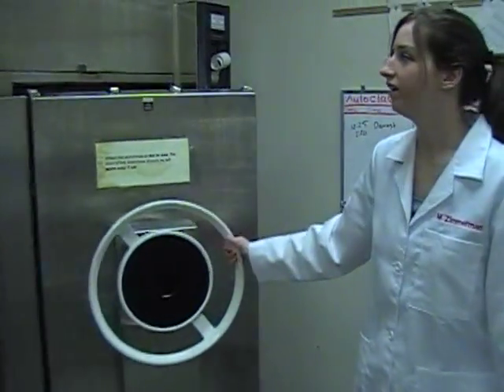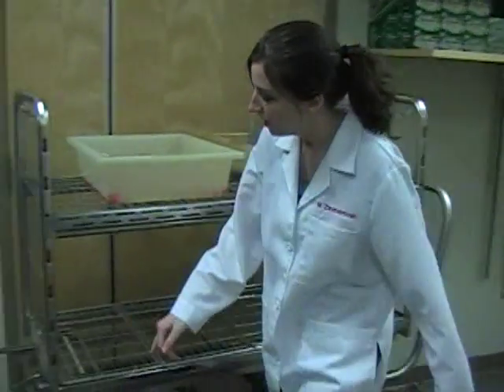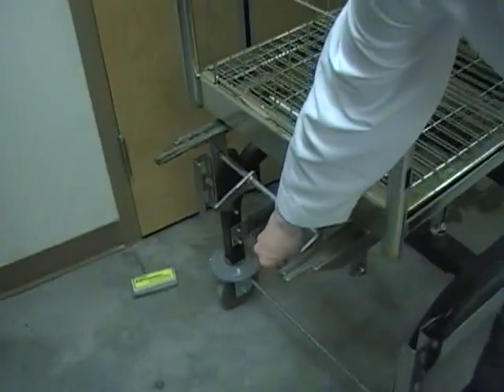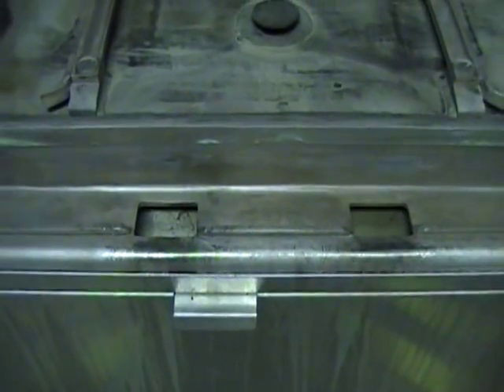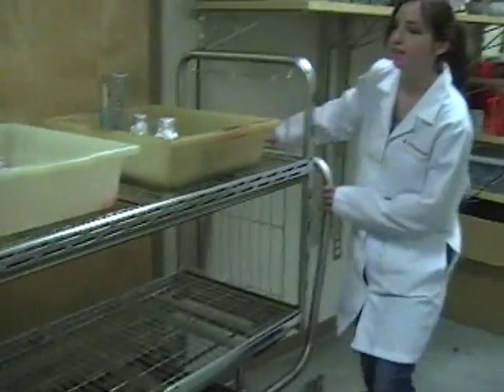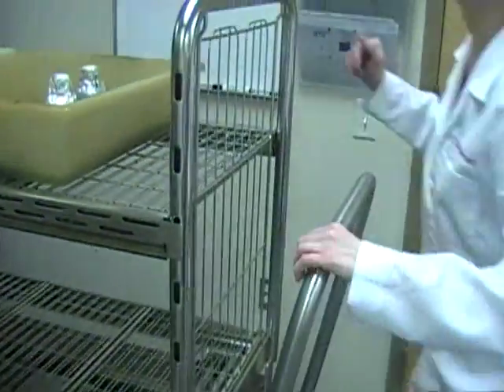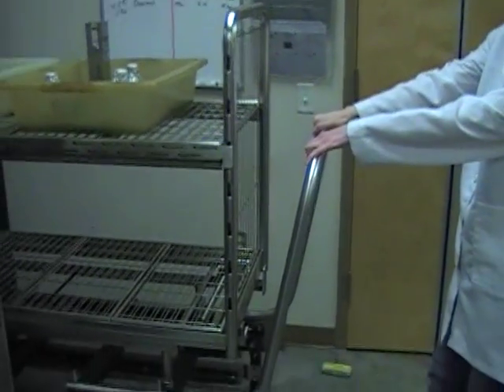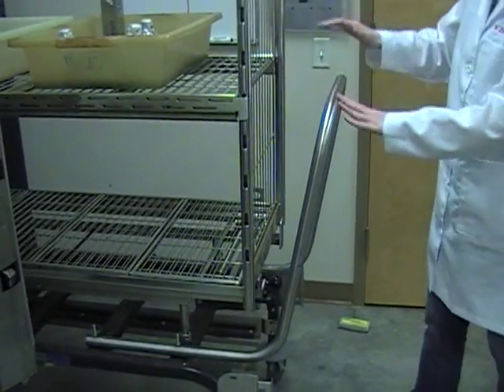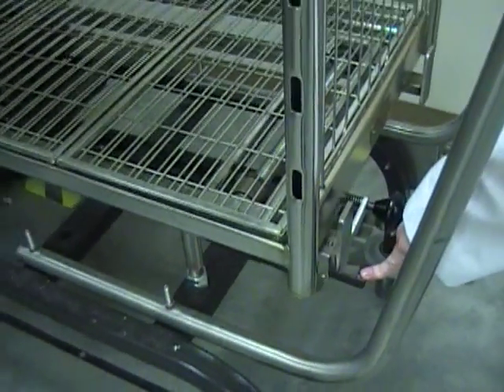Now I can move over to the autoclave door and open it. If you notice, there are two latches right here. These attach to the autoclave inner door. Those two latches attach here and here to secure the cart to the autoclave opening. I will attach those latches to the autoclave opening. I can give a good pullback on it to make sure that the cart is secured in the door. Once the cart is secured in the door, I can push down on the inner latch and push the cart into the autoclave.